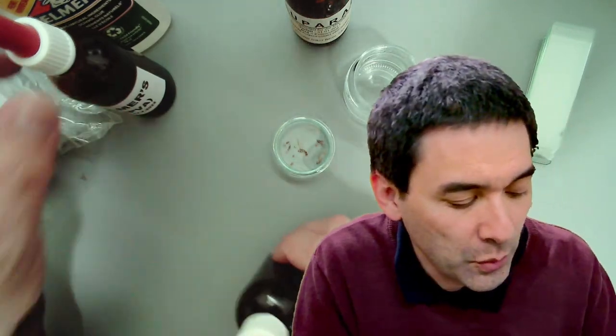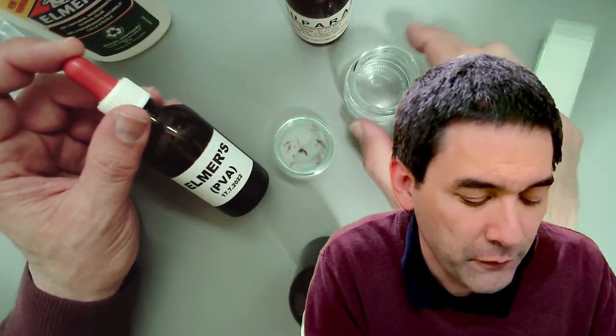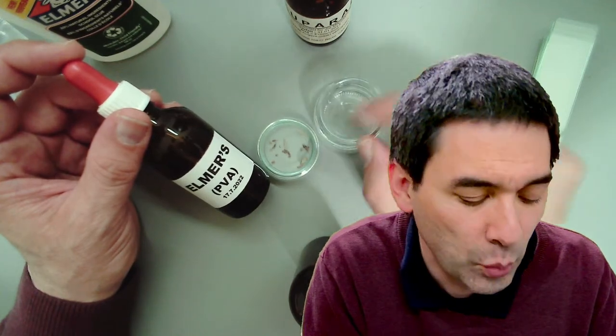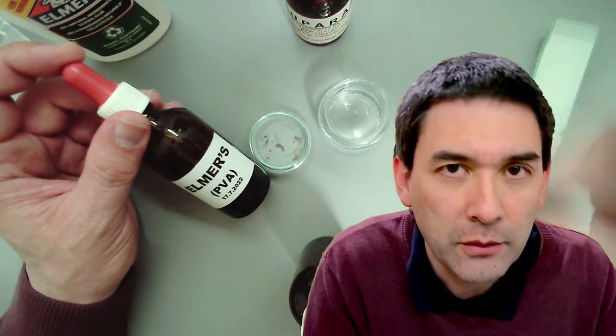And for a few of the mites, I want to use the PVA. I would also like to put some of them first for a couple of minutes into water, soap water, so that you reduce bubble formation. Okay.